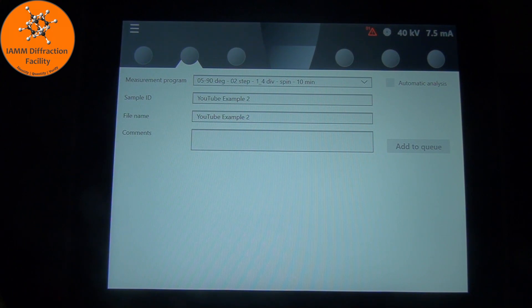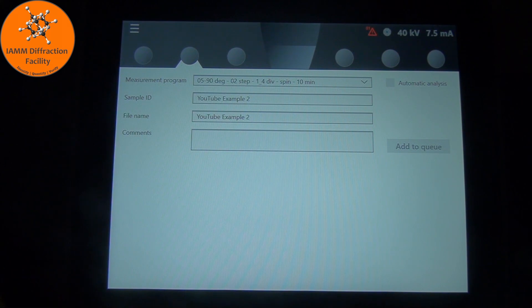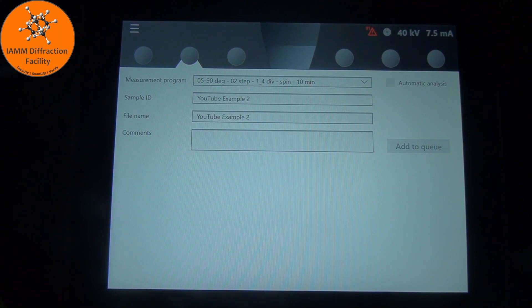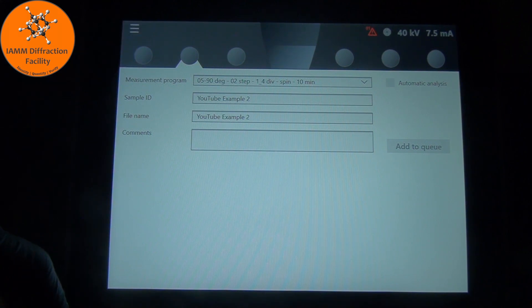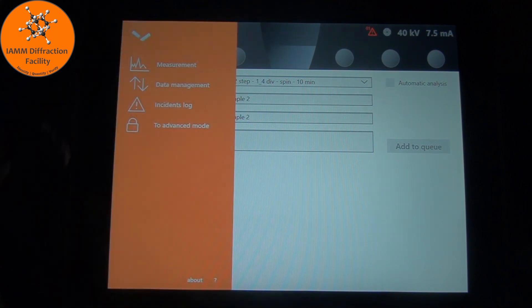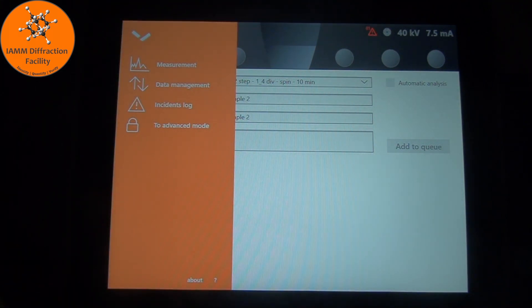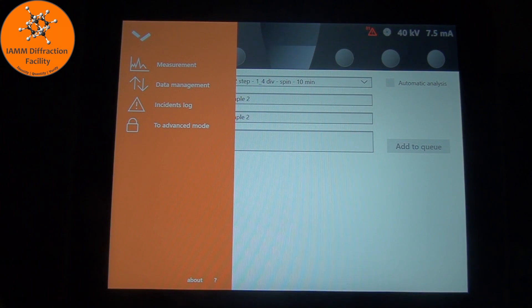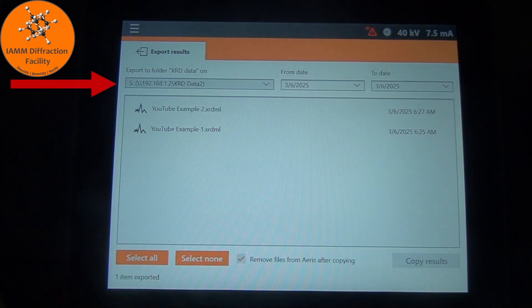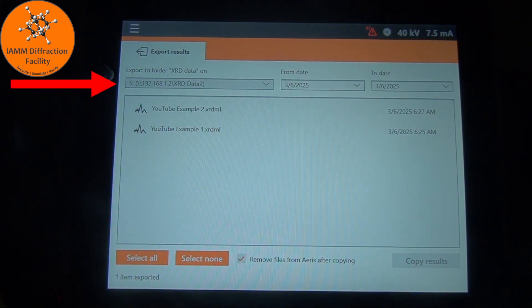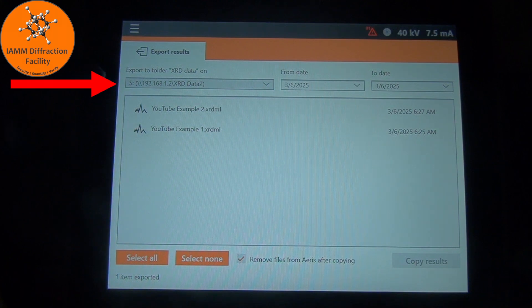In my lab, we have it set up so that there is an external computer that we can copy data to and perform all of our analysis with HighScore Plus. I will click these three little lines in the top left corner and we see some options here. If you want to transfer data, you want to go to data management.